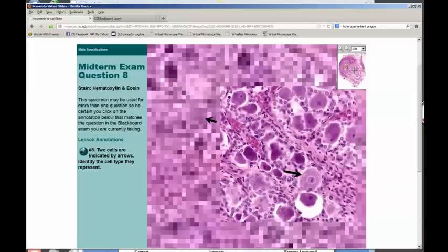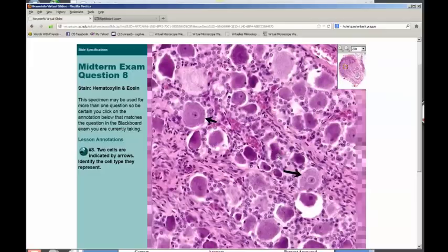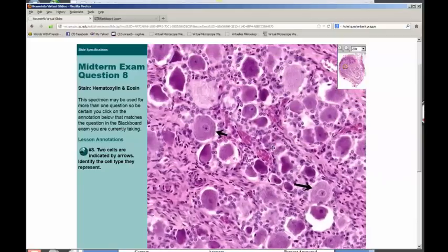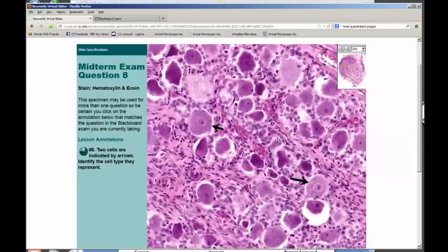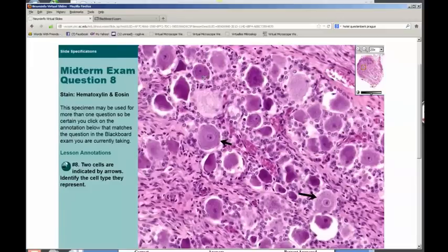And you see, we've taken you to a high magnification within this whole structure here. And you look at these cells, the cells are round. That's one thing you can observe. The cells have a very large amount of cytoplasm, and it has a nucleus, and in the nucleus is a very prominent nucleolus. Now, I don't think you can magnify this anymore, but maybe I won't get in trouble. I'll just demonstrate something. Actually, you can zoom in by doing this. But in this case, the way I have it recorded, it's not enlarging.